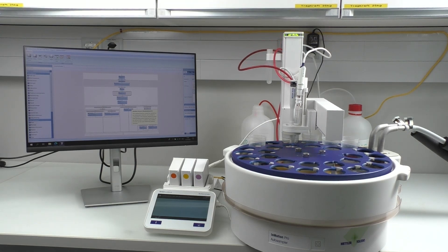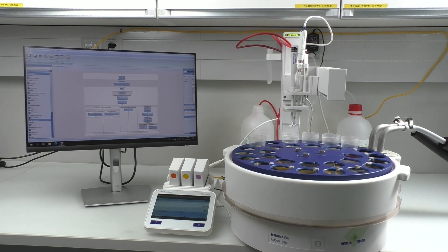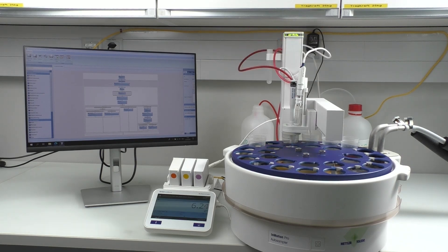This test should be done approximately 5 minutes after the end of stage 2, and the temperature needs to be kept relatively constant at 25 degrees Celsius plus or minus 1 degree Celsius. To determine the pH value of that sample, we must be to the nearest 0.1 pH unit as directed in the pH chapter of USP791. LAB-X automatically compares the pH value to the conductivity value from the table.